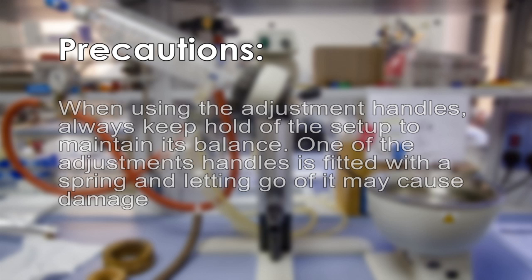When using the adjustment handles, always keep hold of the setup to maintain its balance. One of the adjustment handles is fitted with a spring and letting go of it may cause damage.